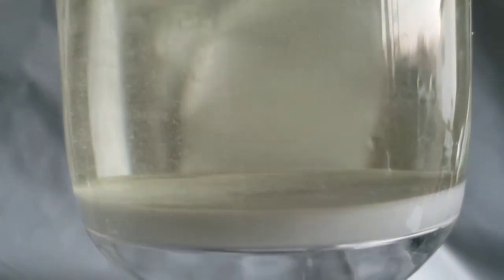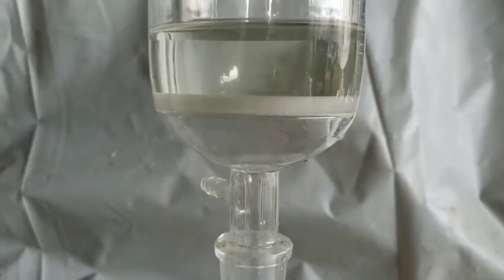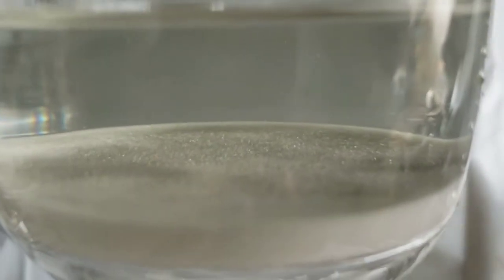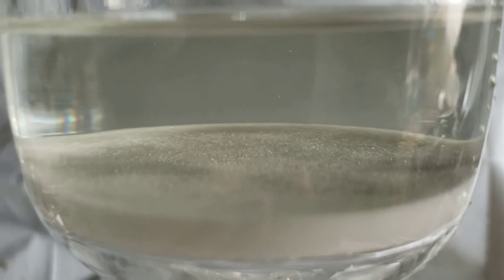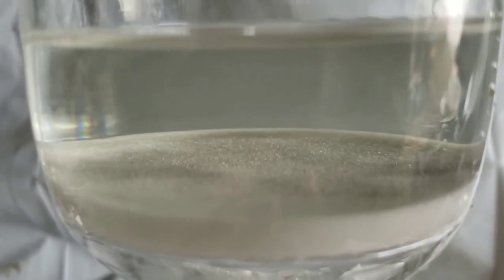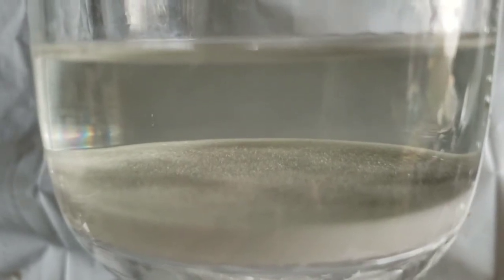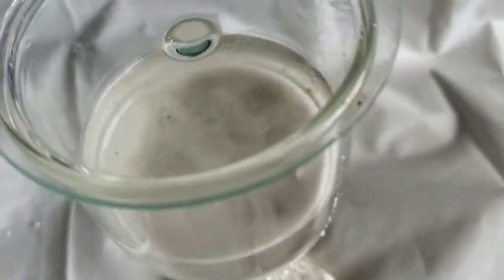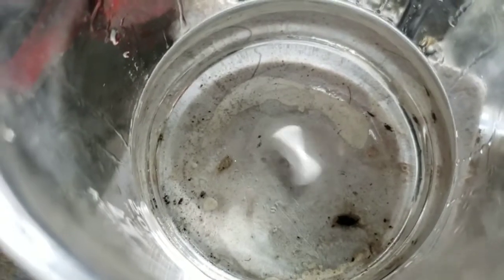The solution still does its thing for a little while, but eventually it runs out of steam and it really doesn't do a whole lot. When it seems like it's finally gotten to a point where it's not doing much at all, I pour it all out into a beaker, put it on my hot plate with some nice fast stirring, boil off all the water, and then start the process over again with some more hydrogen peroxide.